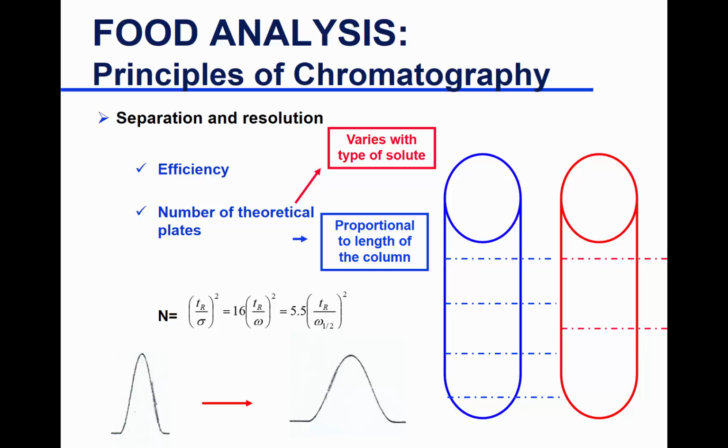So have you heard the term number of theoretical plates before, Vaidi? You did? You have a question? Yeah. If it's a double peak, how will we plug in the value for W2 plus W1 for calculating resolution? Okay, so usually what you want to do is, there is a way in integration where there will be a dotted line. Let me show you.